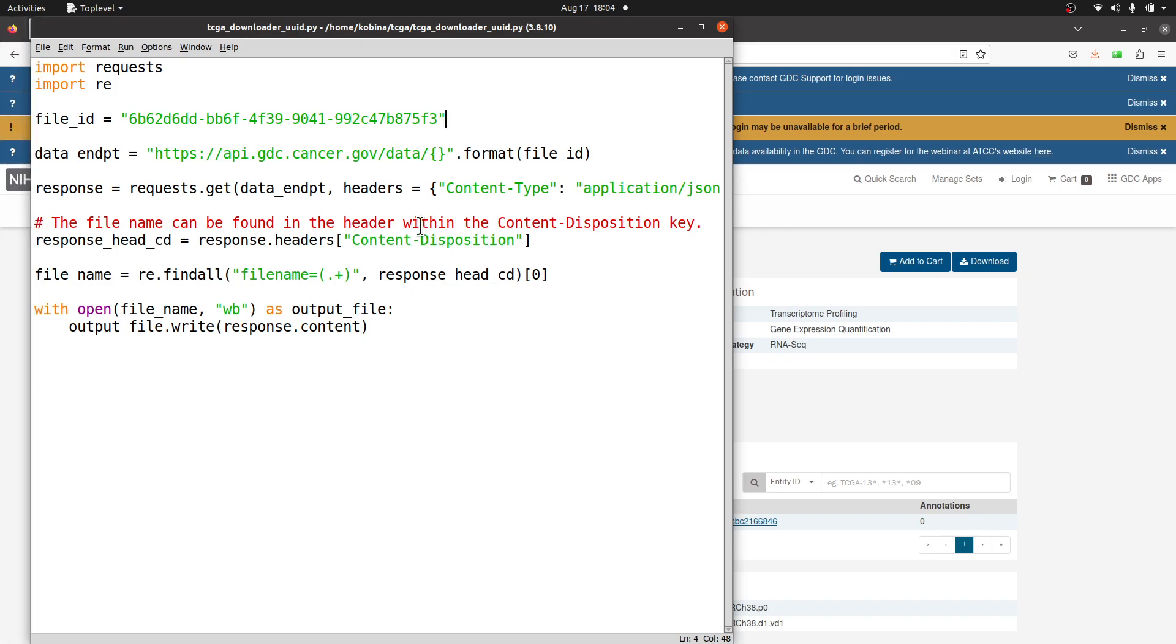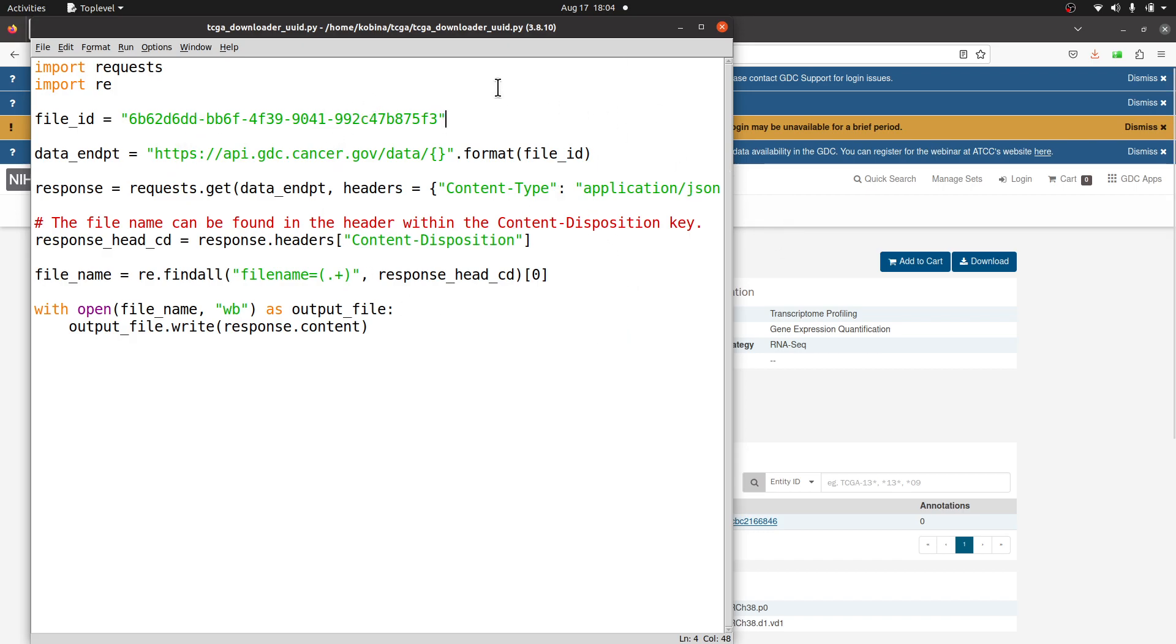If you have multiple files, then what you have to do is put them in a list and then do an iteration. You have to create a loop and then do that and run the Python code and then get the ID one by one and then download.